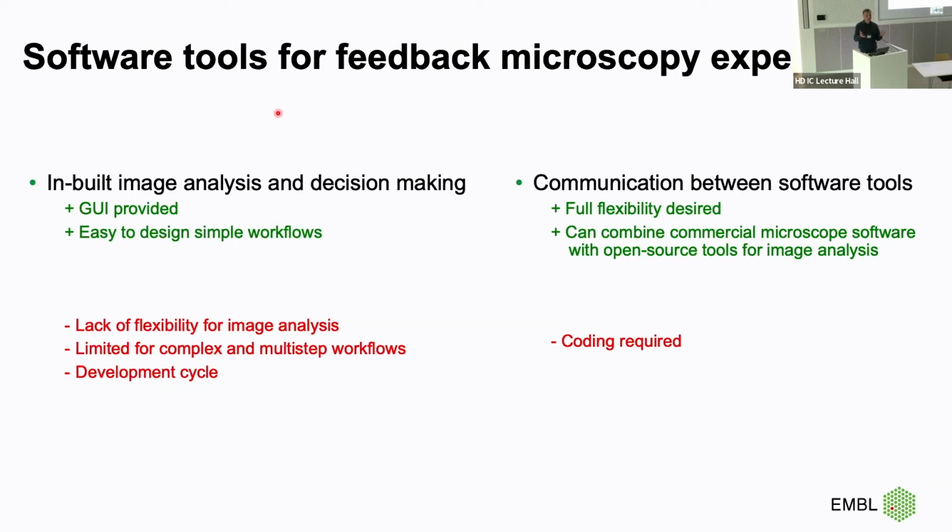So in this case, because you will control the entire workflow with some kind of script, most likely you have entire flexibility, but most of the time to establish such a workflow, one would need the coding required, right? And each time for the particular workflow, we probably would need to code it from scratch. So what we wanted to achieve, right? We wanted to conceptualize this workflow and say, okay, you might need coding to do your specific task, for example, for your specific analysis. But maybe if we decide on how the different units will communicate between them, we can abstract it in such a way that the requirement of coding will be minimal for each particular project.